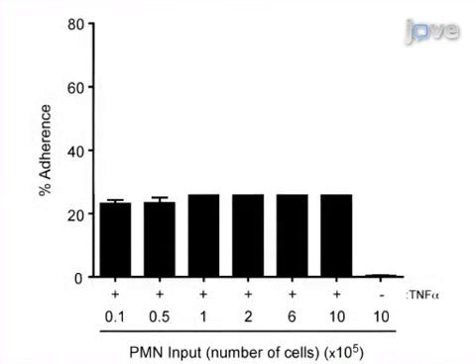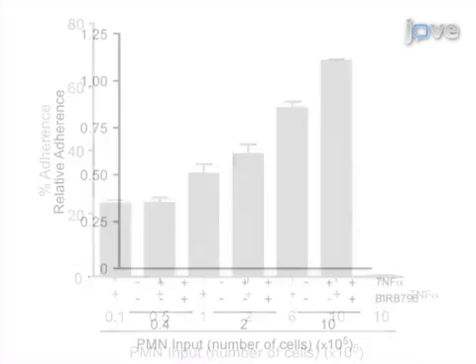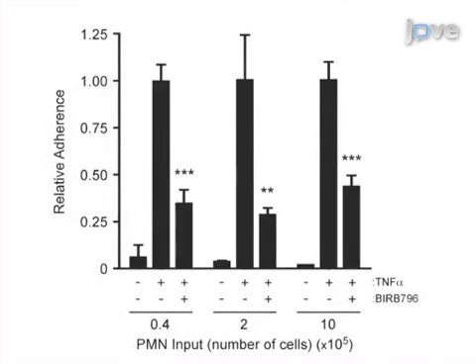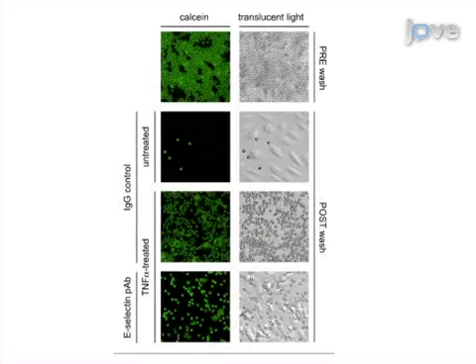Ultimately, the percent and relative adherence of the calcein-labeled neutrophils to the endothelial cell monolayers under each treatment condition can be determined.